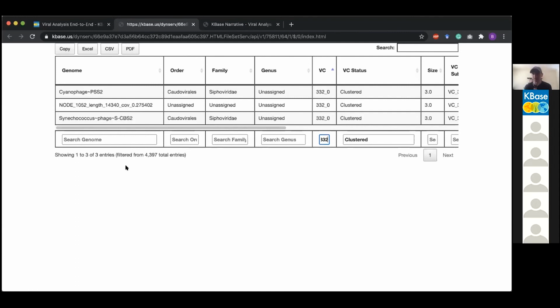These are almost certainly part of the same genus. And there is actually a paper that was published not too long ago that identifies these two as highly prevalent in the actual station that I chose. And I was super thankful that that happened because I didn't know going in before this. I knew there were viruses in the sample, but I didn't know what kind. I expected, because from literature search I know that cyanophage and Synechococcus are globally abundant and widespread, but particularly at the station, I think it's station 36, that I chose.